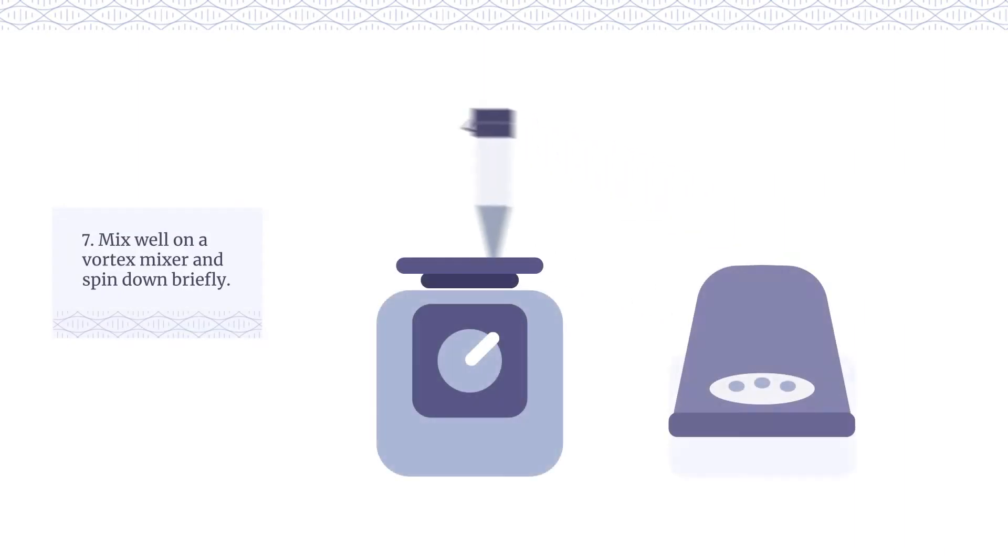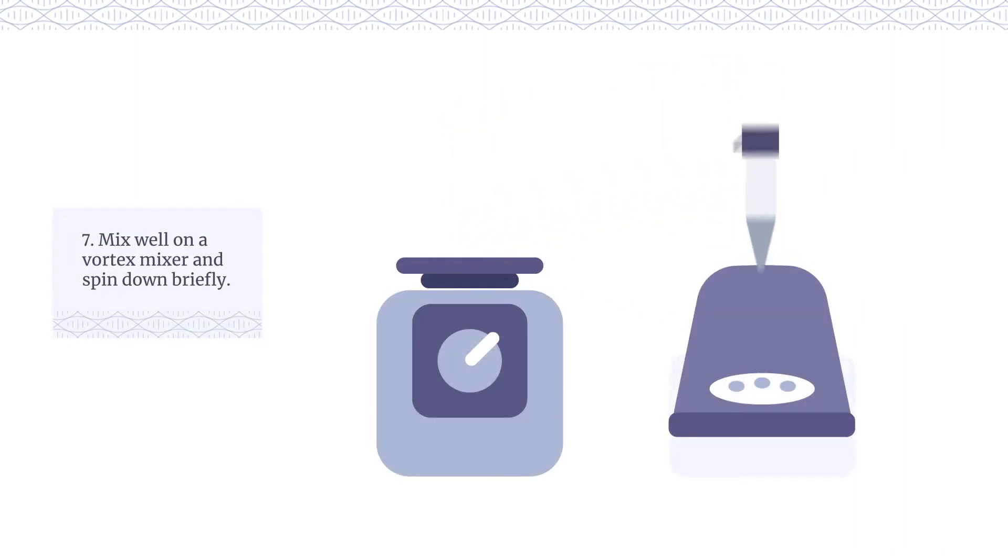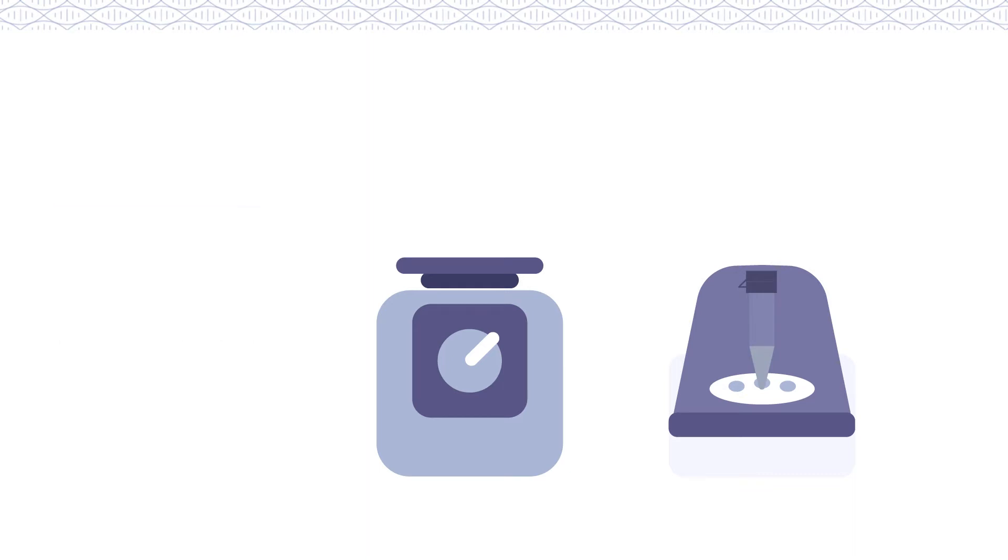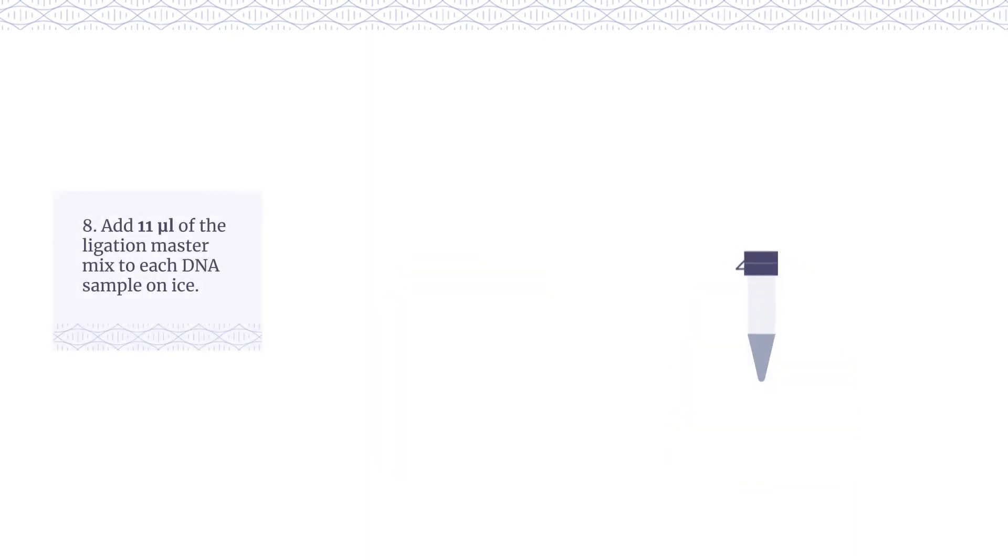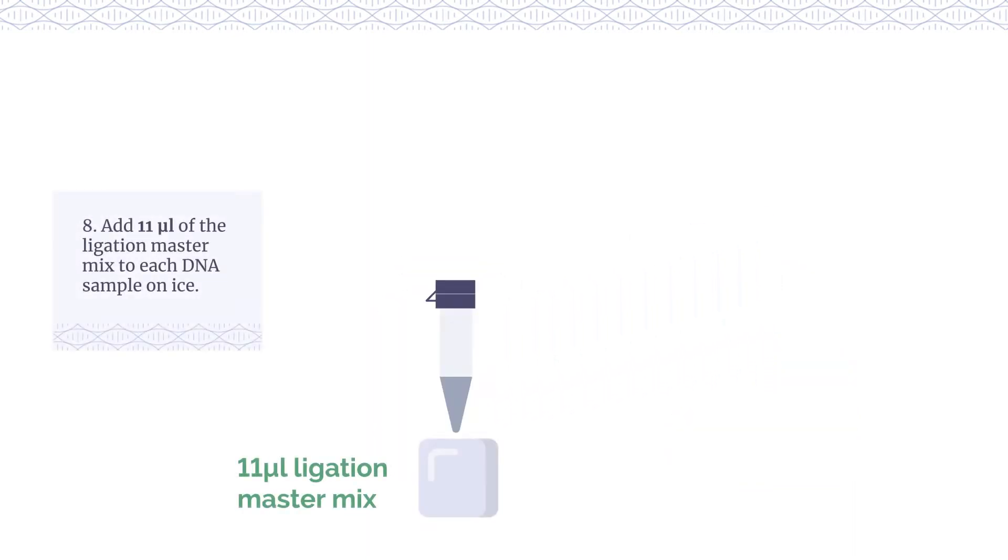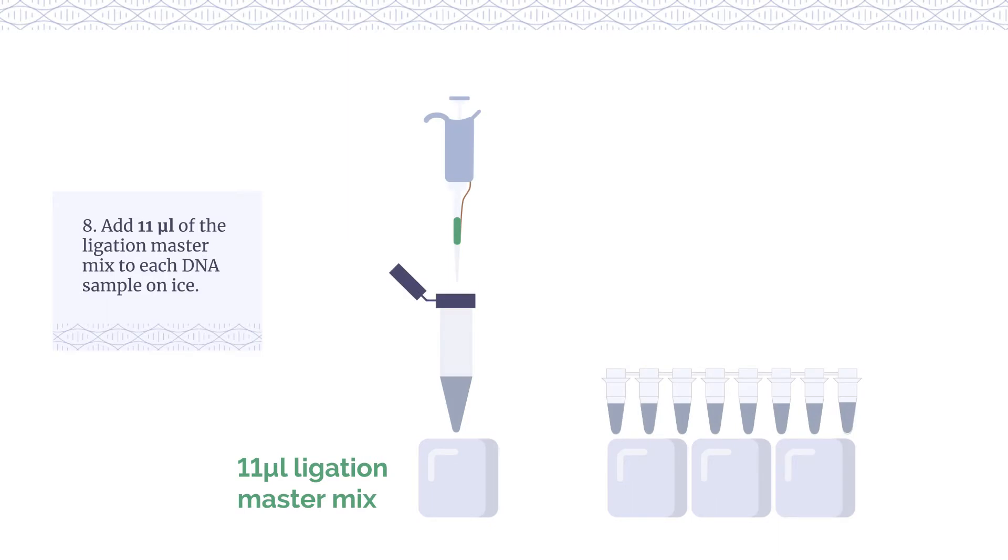Mix well on a vortex mixer and spin down briefly. Add 11 µL of the ligation master mix to each DNA sample on ice.